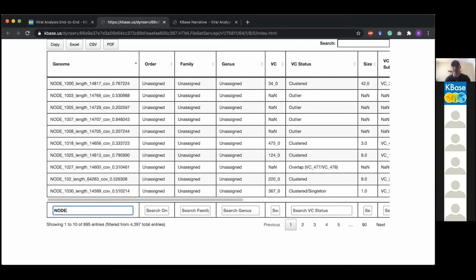So basically take the genomes that are associated with the references, as you'll see in a moment, and do another stage of analysis. Maybe there are some marker genes in that clade or group that the references also have, in which case they can go and make that claim that, yes, this is part of the same genus.